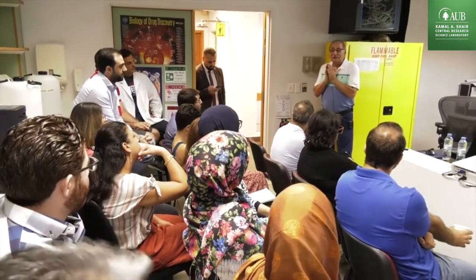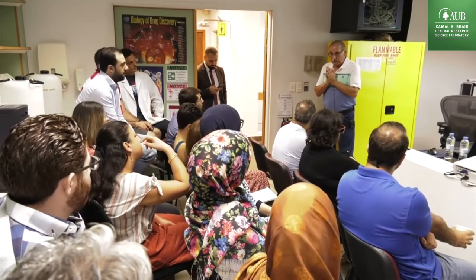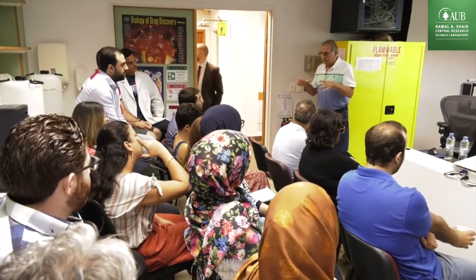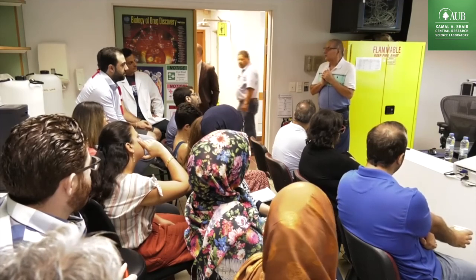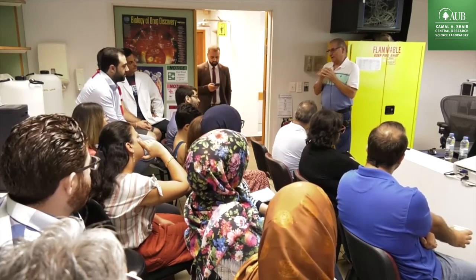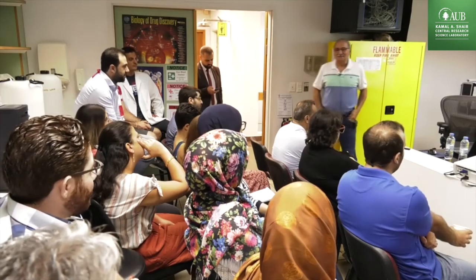So we don't care about the absolute number, only relative numbers. You have some catalyst, I have another catalyst, in the same family of catalysts, and we would like to know which one is more active. Just for comparison. It doesn't matter the real number. We don't care about the real number. Like this, it's clear. Okay? Good. Any other questions?